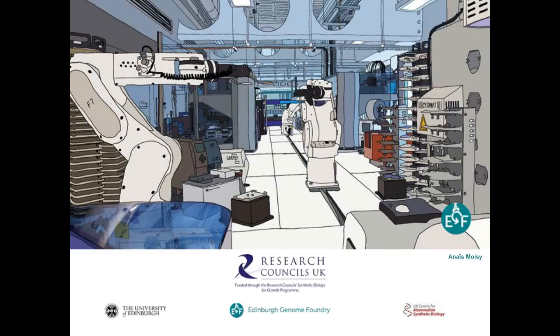Do you do your own agar plates? We do indeed. It can be a fairly arduous process, but we do indeed. It's a very bog standard process. We take molten agar and we pour it in an omni tray, which are the rectangular SBS sized containers that you saw earlier. It does have to be fairly consistent. It has to be fairly flat because the QPix doesn't like plates which are very bumpy or very uneven, but it is a manual process, yes.